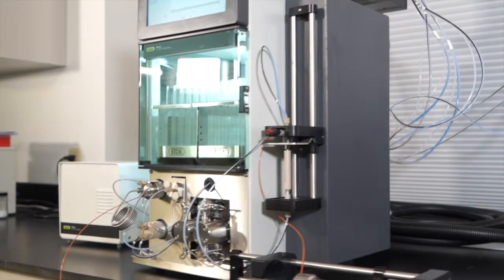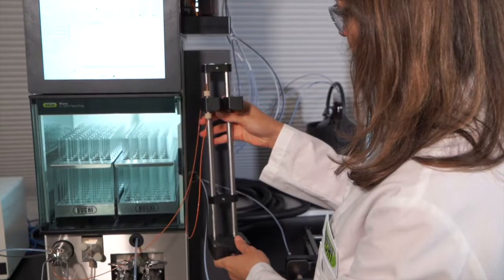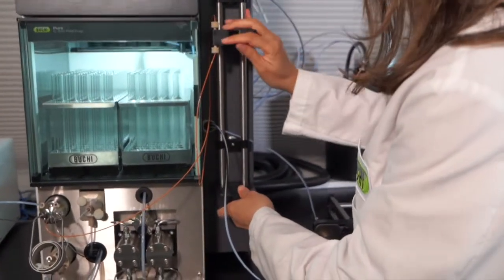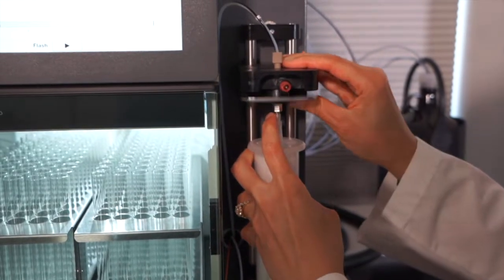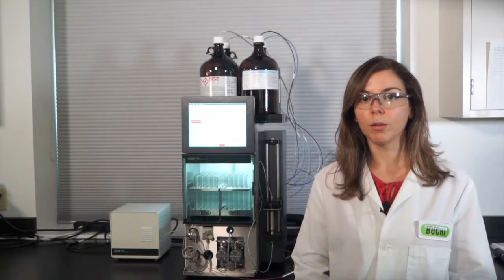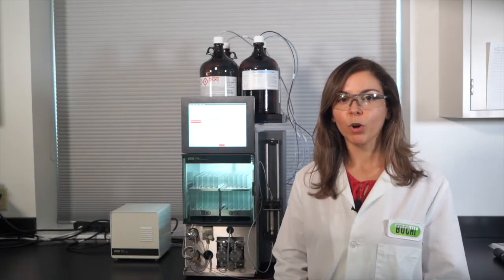Moving back around to the front of the Pure instrument, you can see the cartridge and column holders. These are easily accessible. The flash column holder accommodates 4 grams to 330 gram cartridges. Additionally, we offer larger column holders if you wish to run larger sizes, 750 grams up to 5 kilo. You also have the flexibility of performing liquid and solid loading. The modular nature of the cartridge holder enables the orientation of columns to be switched to either go with or against gravity.